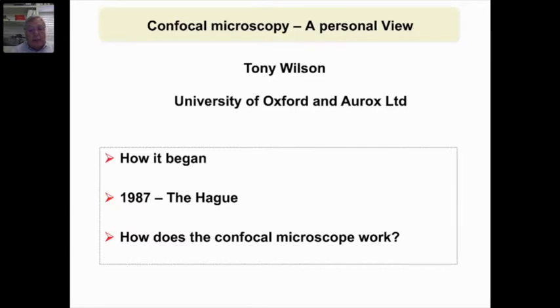I first ran a conference in The Hague in 1987, and it's marginally interesting to have a look at what those talks were all about. And the other thing I want to emphasize as we go through this is that I started off believing I knew how the confocal microscope worked, and then pretty quickly realized that I didn't really, and it was much more subtle than I had first thought.